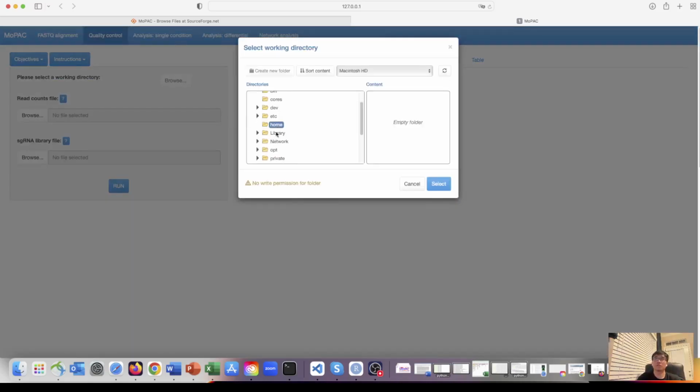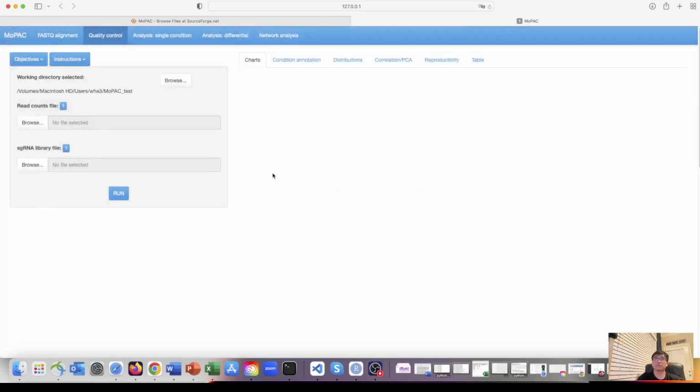I put the directory under here. It's called MoPAC test. Let's select.